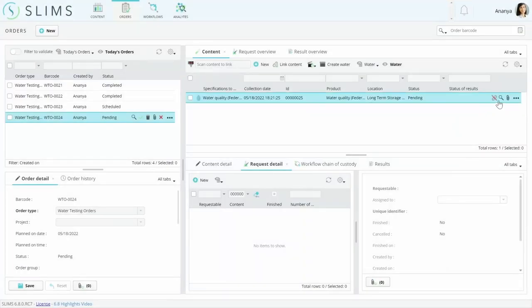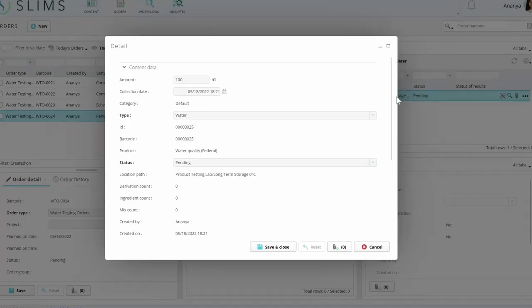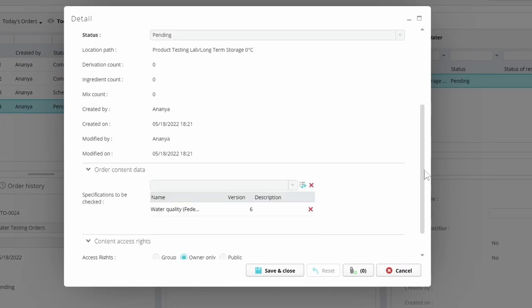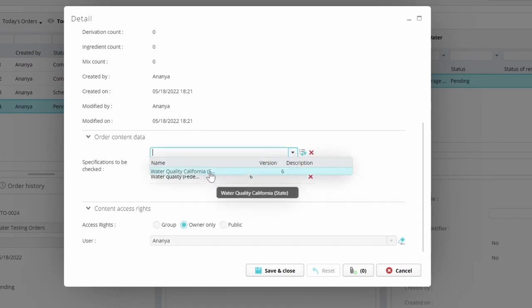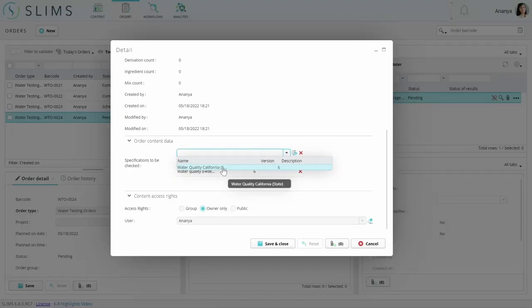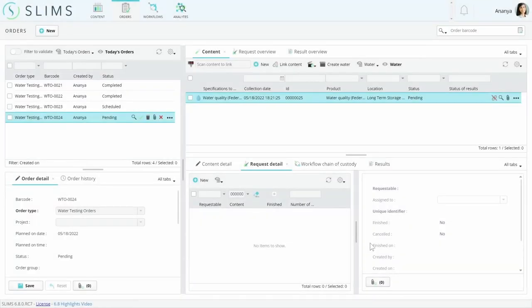You could already link content without a product to an order and assign the product there, but now you can add multiple sub-products in addition. This allows you to request specifications from the product and all sub-products and they'll all be added to the order.